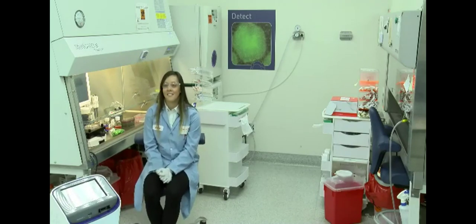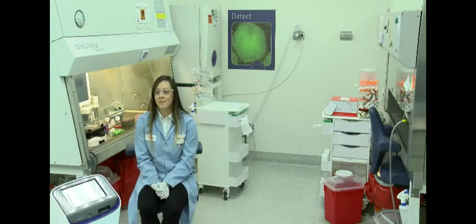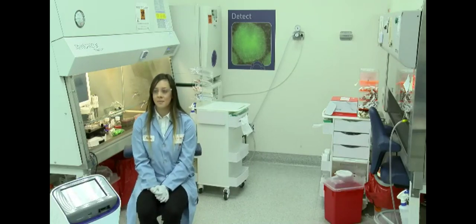All right. Thank you, Jordan. It was a very nice demonstration of how we can make neurons out of induced pluripotent stem cells. So we received a number of questions around the process, starting from iPSC all the way to neurons.